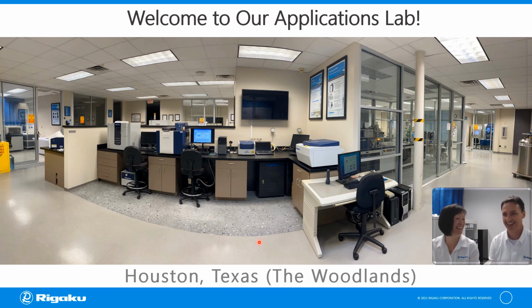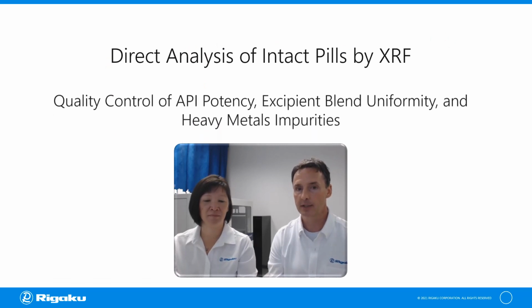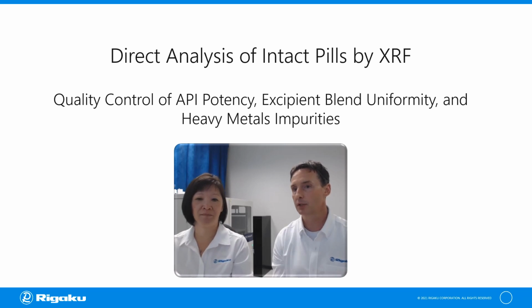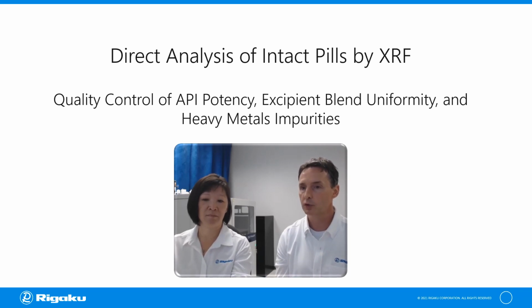And I'm Thanh Nguyen. Today we're going to talk about direct analysis of intact pills by XRF. Essentially that is quality control of API potency or excipient blend uniformity, heavy metals, impurities, but without having to prepare a traditional type of sample, which may be grinding. We'll talk about that in a little bit, but it would be grinding or pressing into a puck and analyzing a set. What we're going to show here is analyzing everything as a final product without having to do any prep at all.